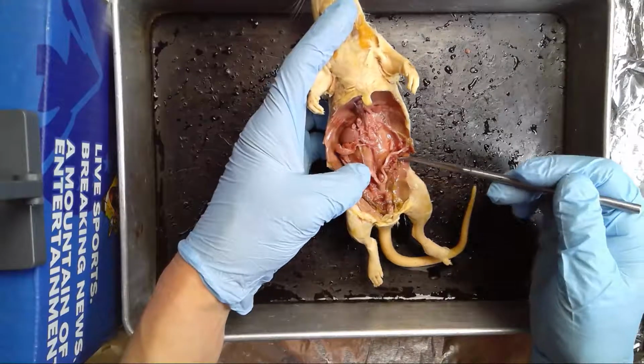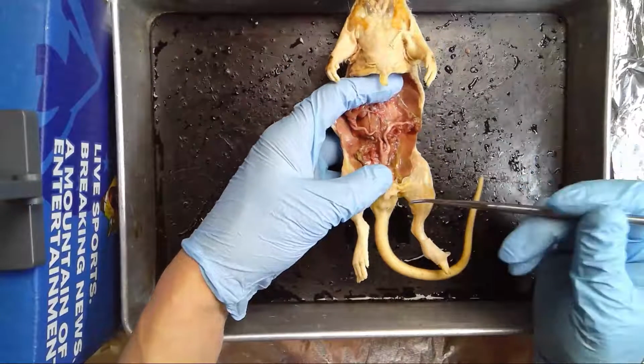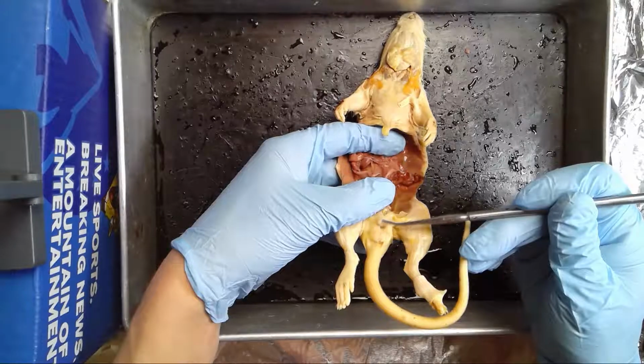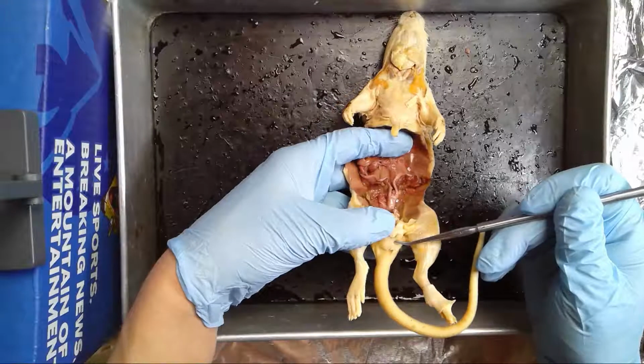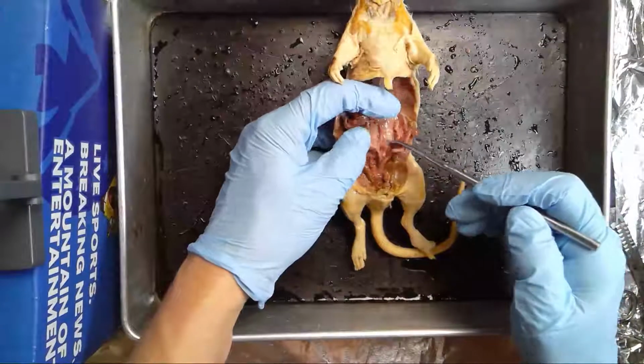So let's look at the female reproductive organs. We can start by looking at the openings. So we have the opening here, so urine would come out of the urethra. Just below that we have the vagina, and finally we have the anus. Okay, so let's look at the reproductive organs.